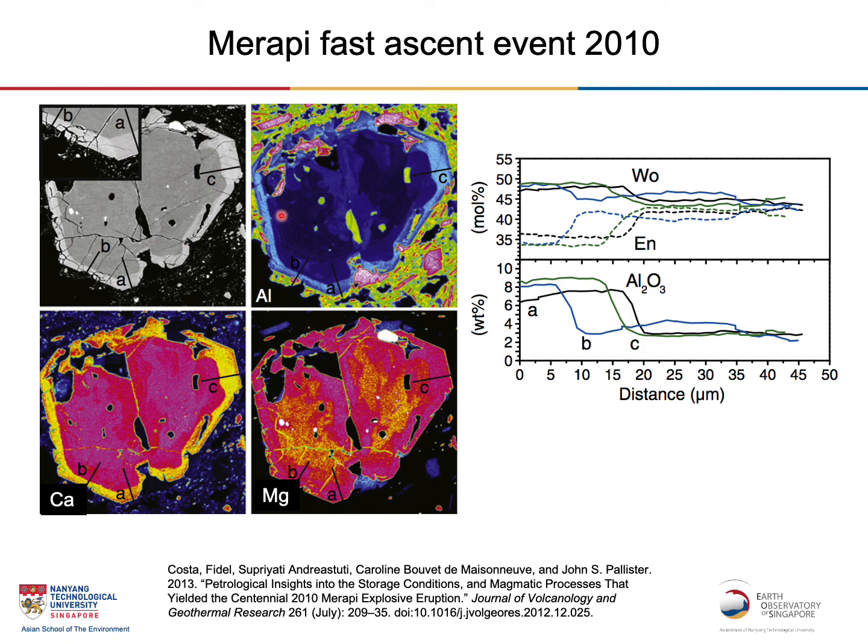So knowing the chemical composition and how it changed across the different textures, here there's also an example of how we can deduce the time scale of this magmatic process. In 2010, for example, calcium may be rich on the outside and lower in concentration on the inside. By utilizing diffusion chronometry, we can deduce the time scale that this chemical zoning was recording.